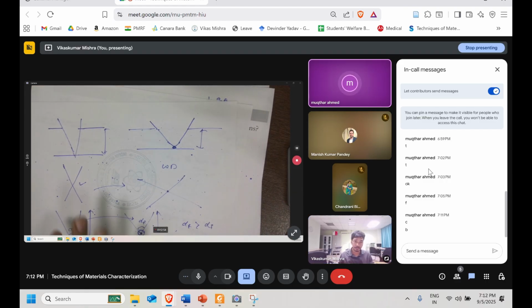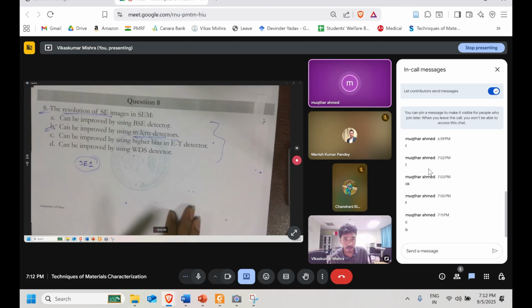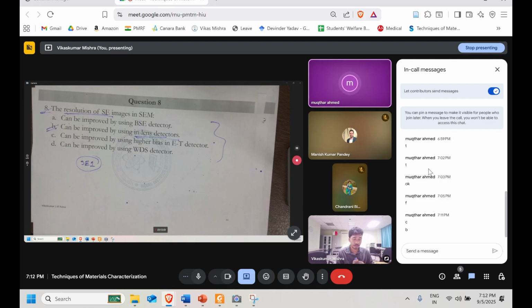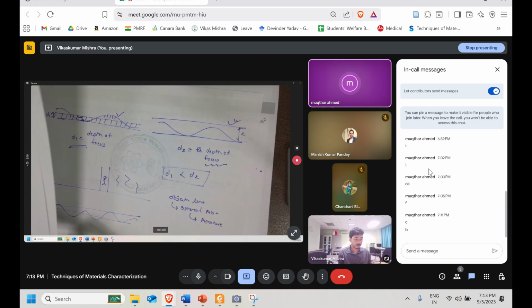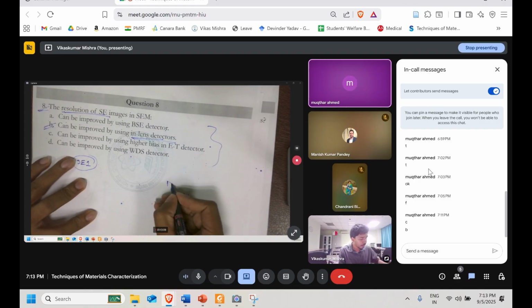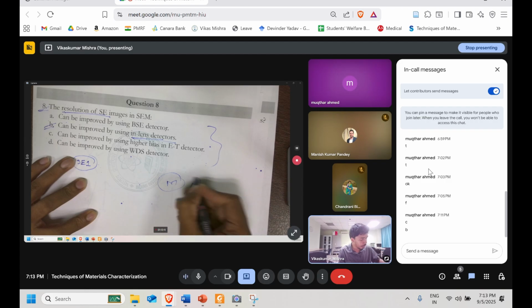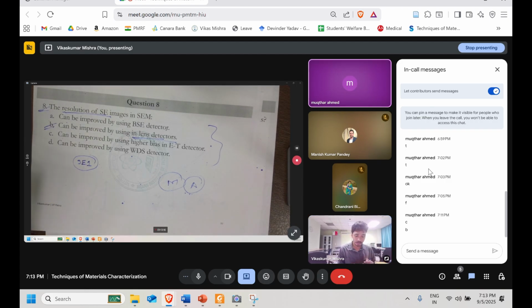The formula you wrote, no? Depth of field, and there, 2S W field MA. M is magnification. Is A something different, or is it MA for the magnification? M is there and A is there. M is magnification, A is aperture diameter.